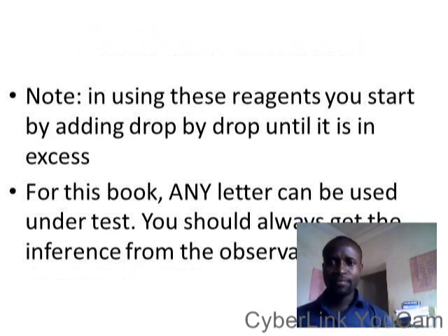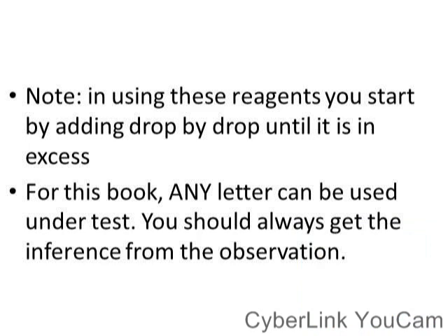Note, in using these reagents, you start by adding drop by drop until it is in excess. For this presentation, any letter can be used under test.